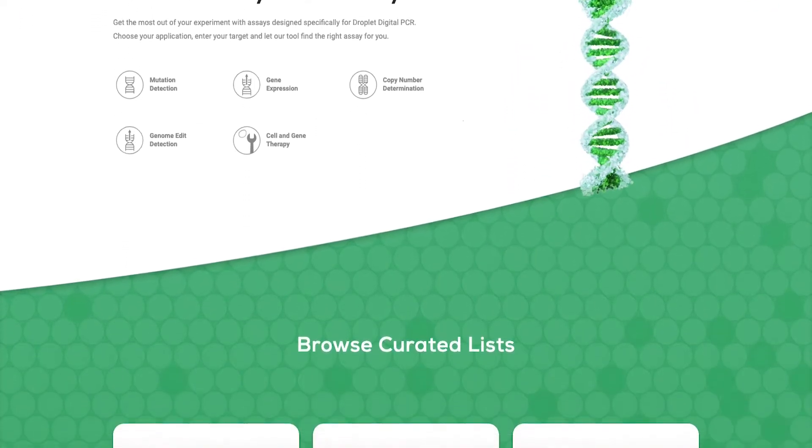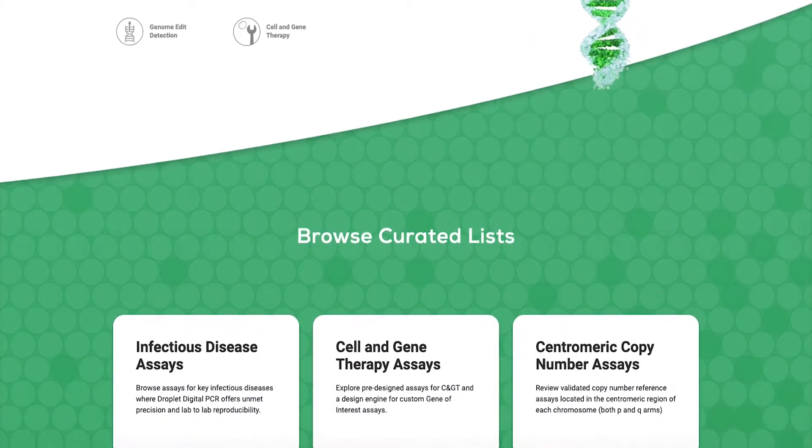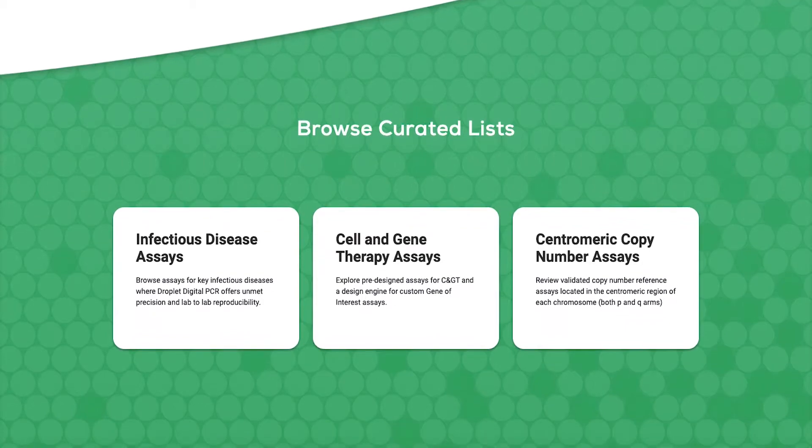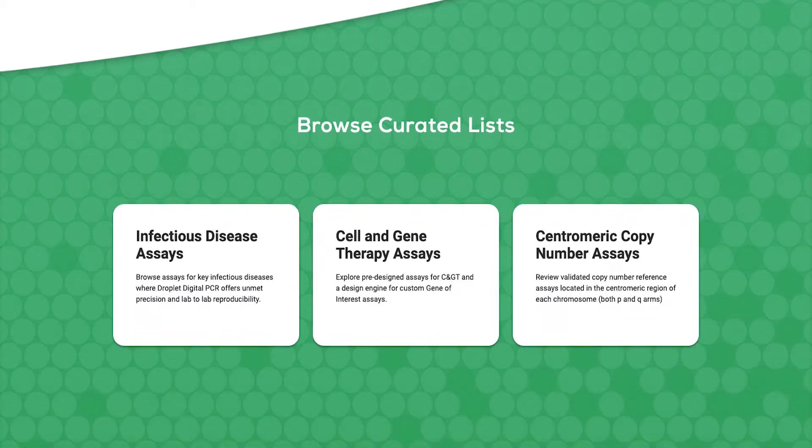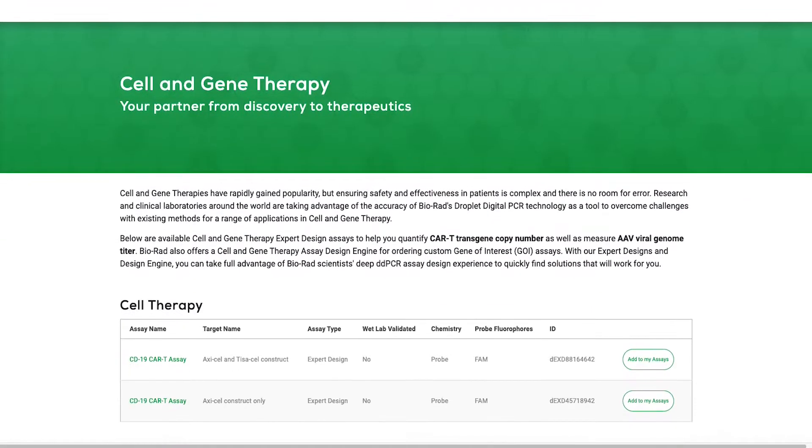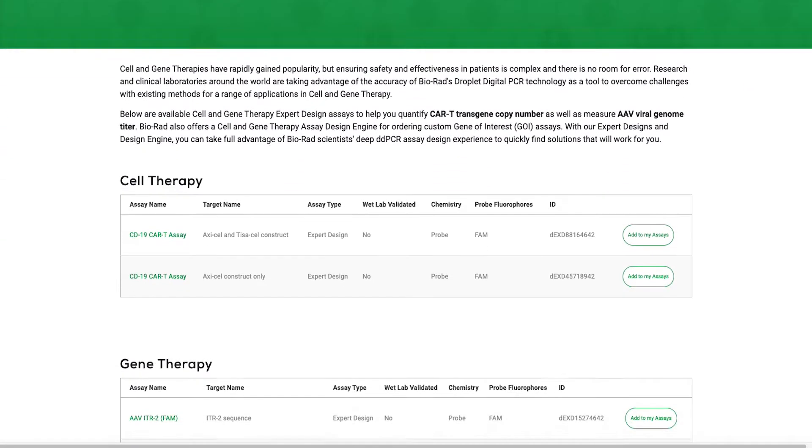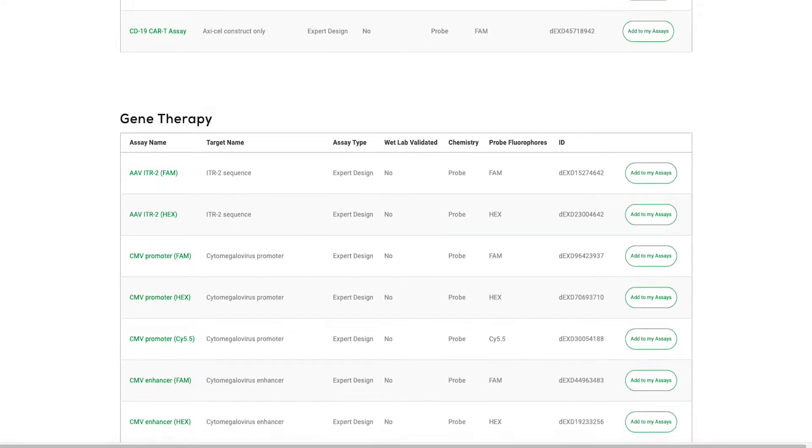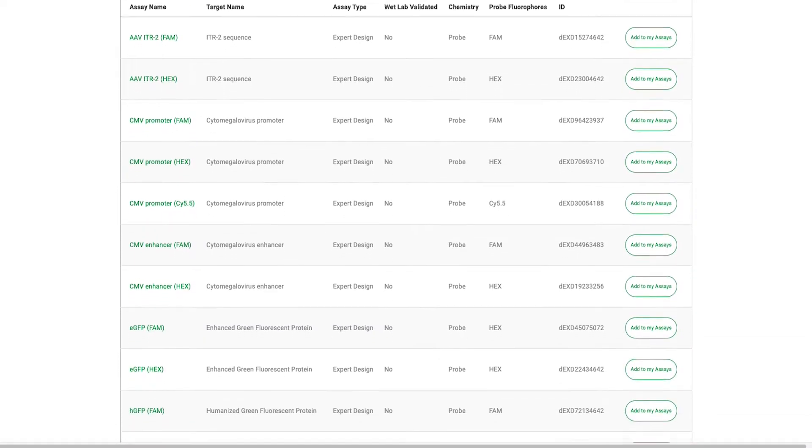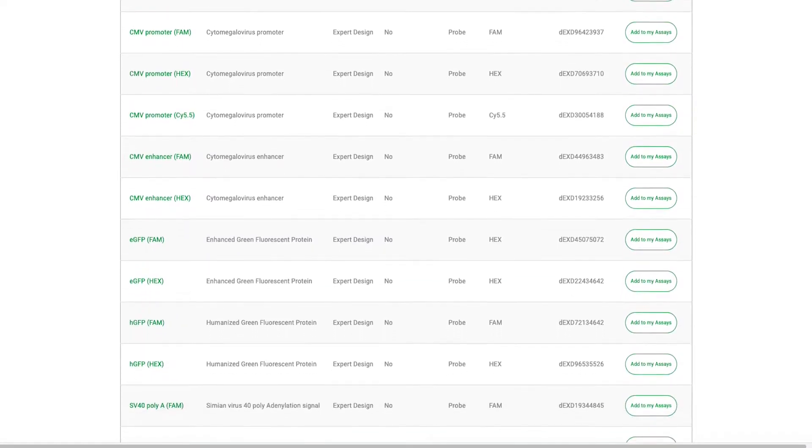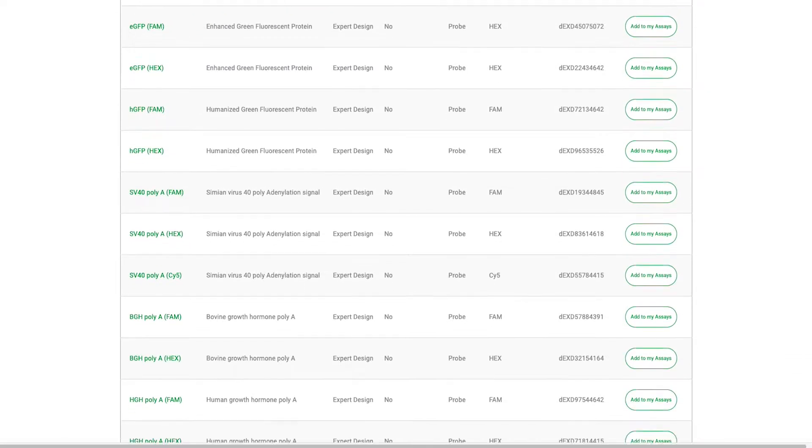The DDPCR experts at BioRad have built the digital assay site and cell and gene therapy assay design engine to provide a simple and convenient user interface that allows you to find pre-made vector backbone assays using the curated list of cell therapy and gene therapy assays.